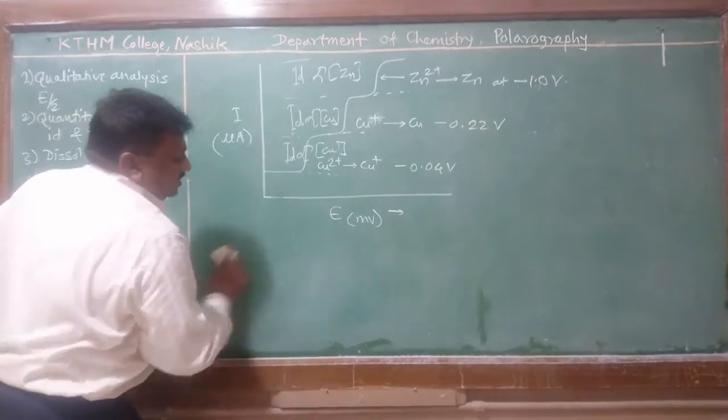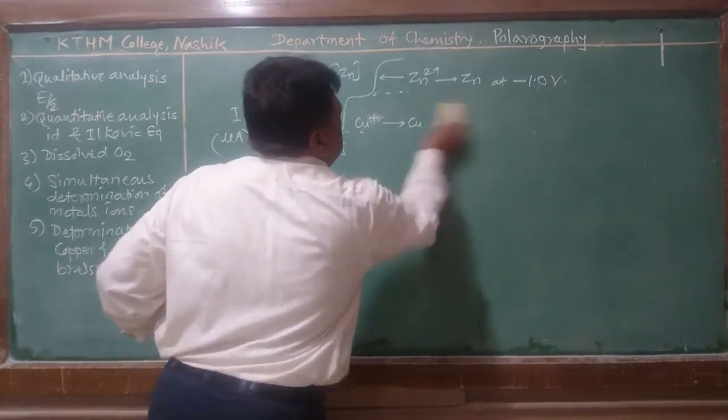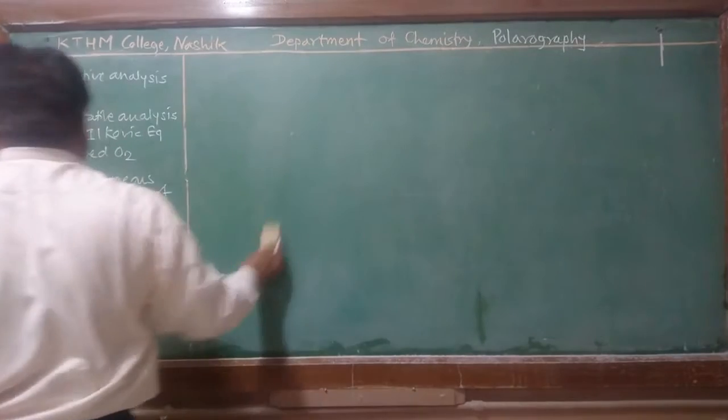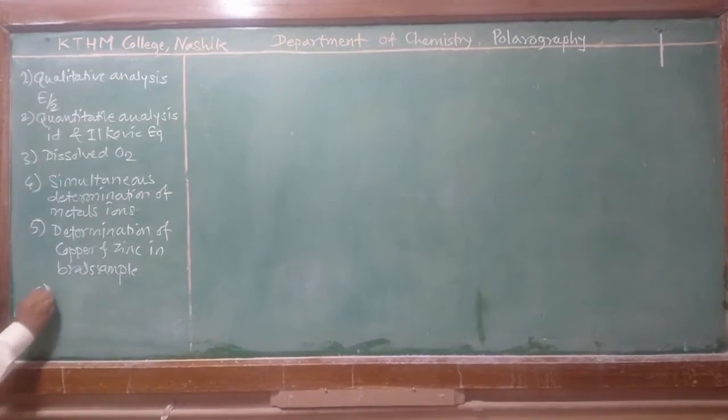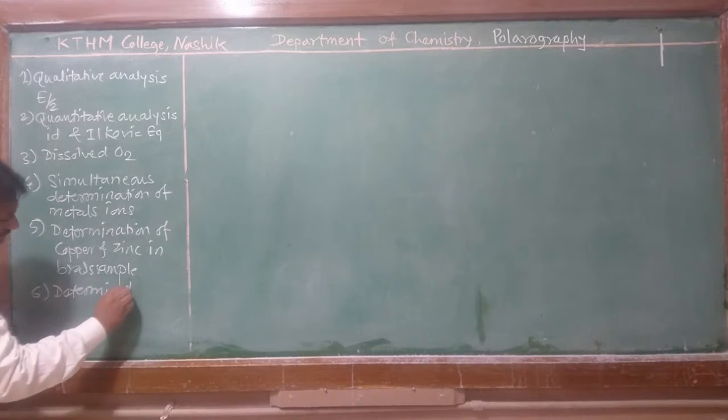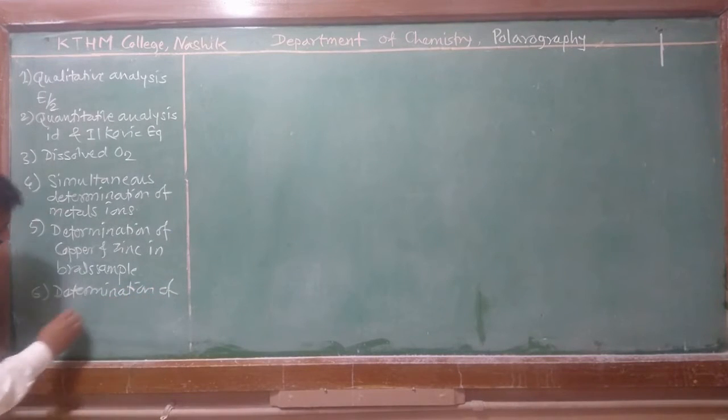Students, now we discuss the next application, that is, analysis or determination of organic compounds.